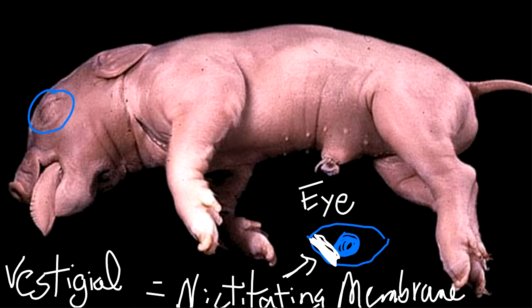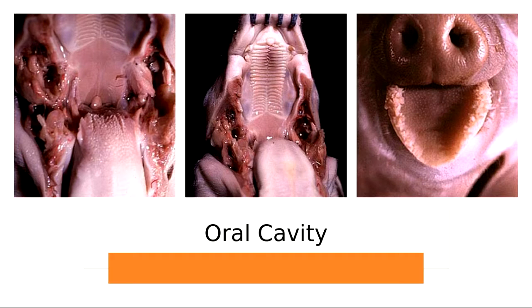Now after you finish with the external anatomy, it's time to start digging inside. Here's the mouth and the snout.